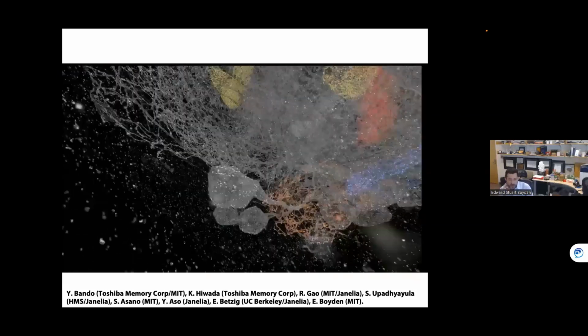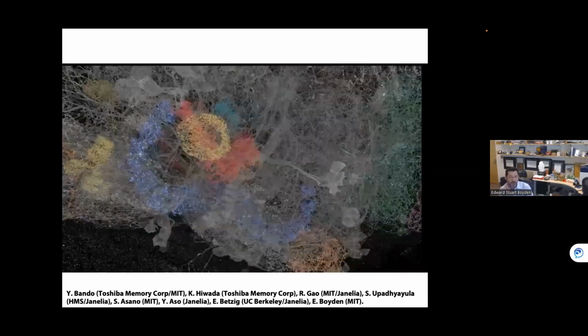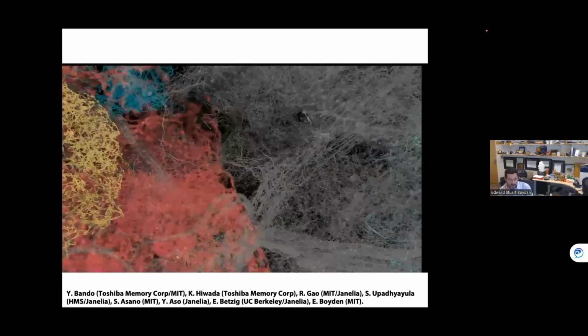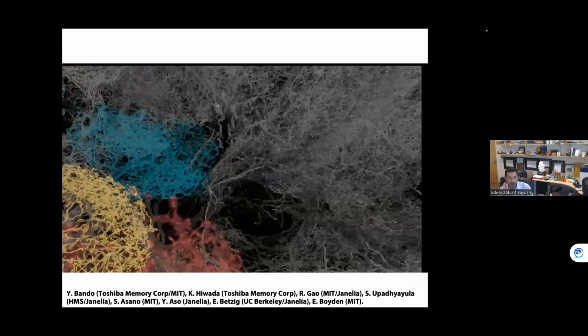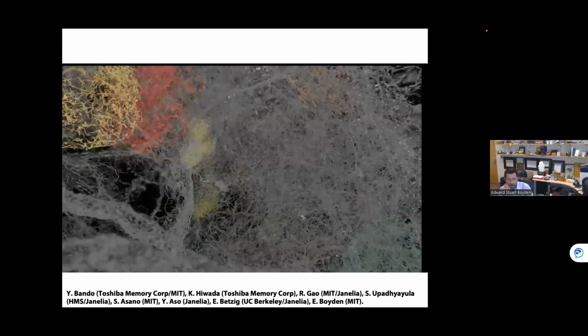So expansion not only democratizes nanoimaging for ordinary microscopes, but if you are willing to use a specialized microscope, you can image very large-scale objects, even entire brains in their intact state in a single setting.